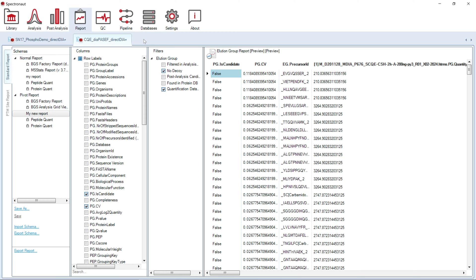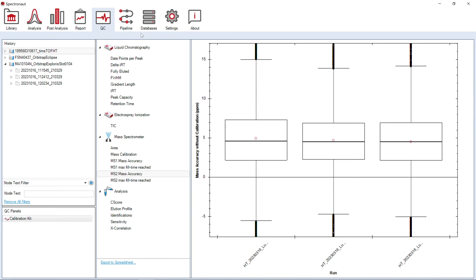In the QC Perspective, you can visualize multiple metrics related to quality control.